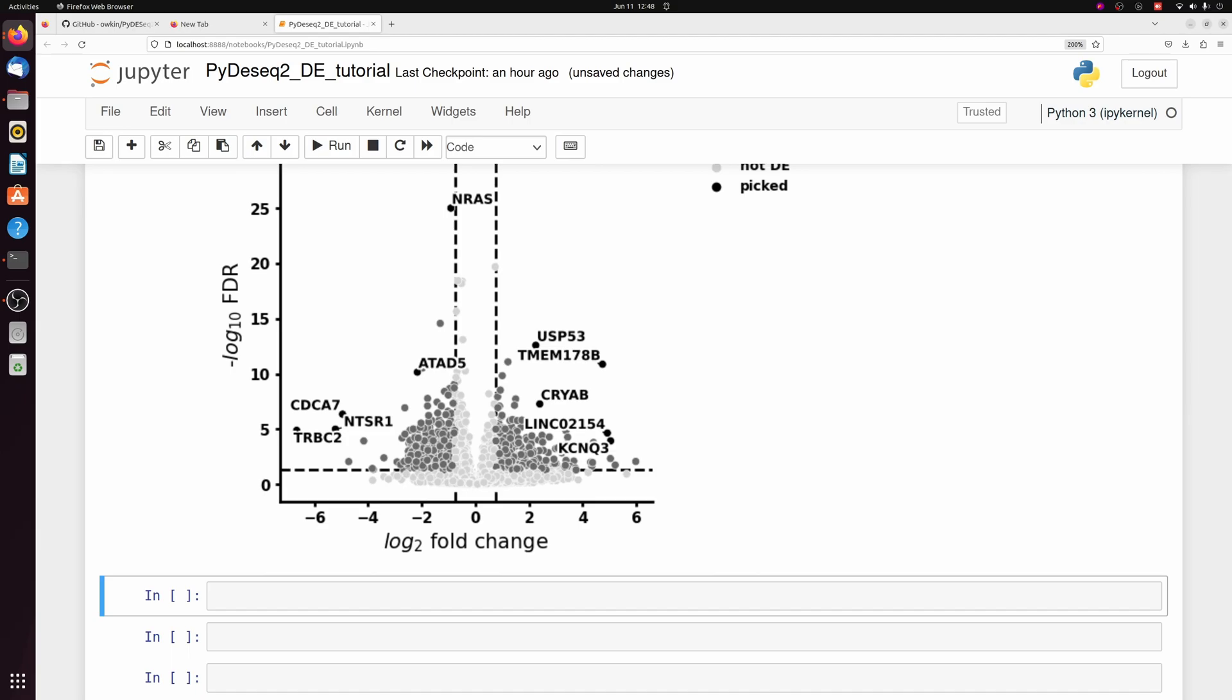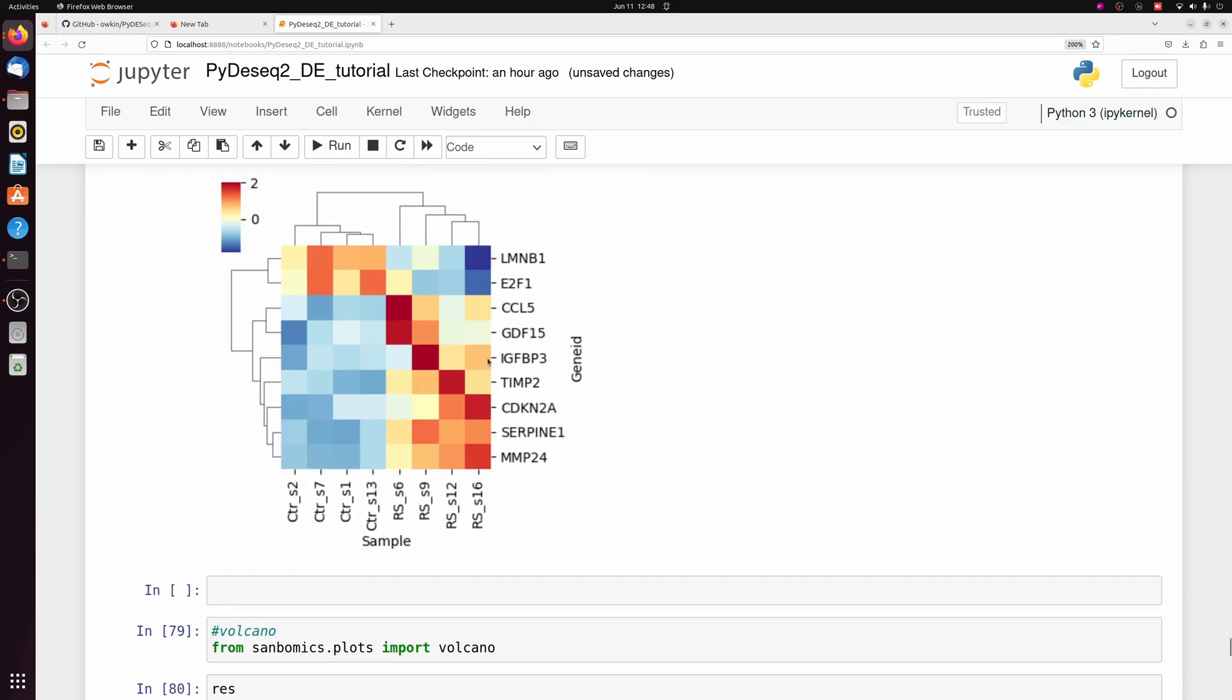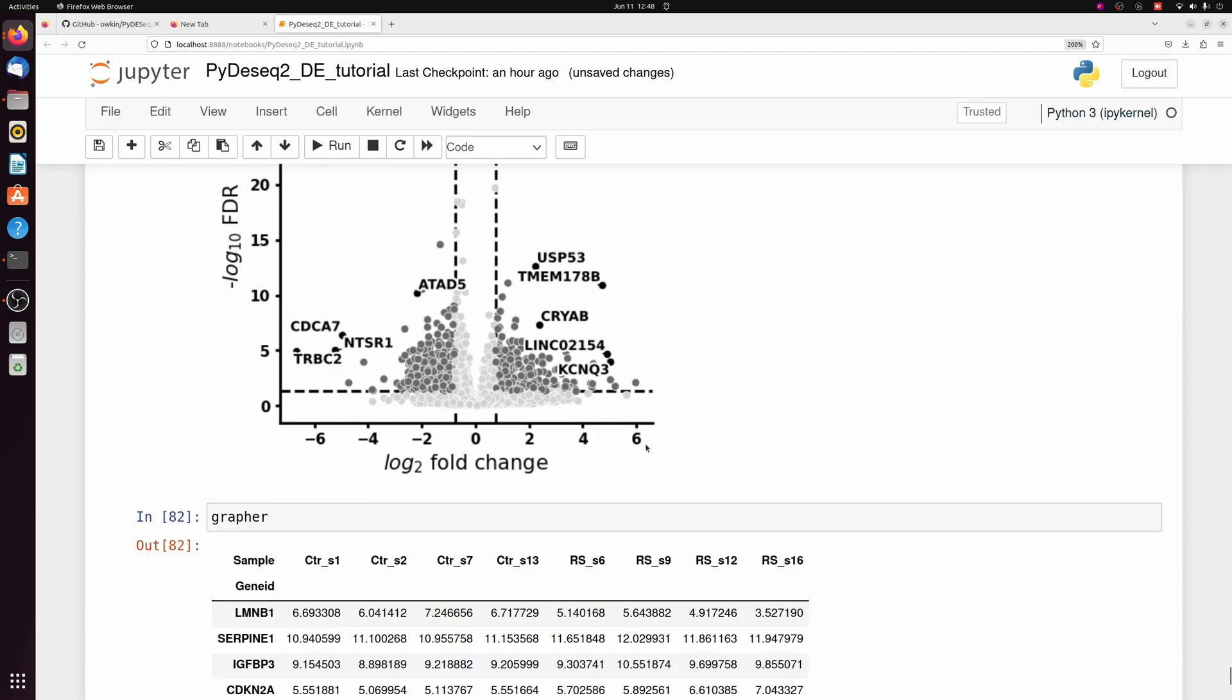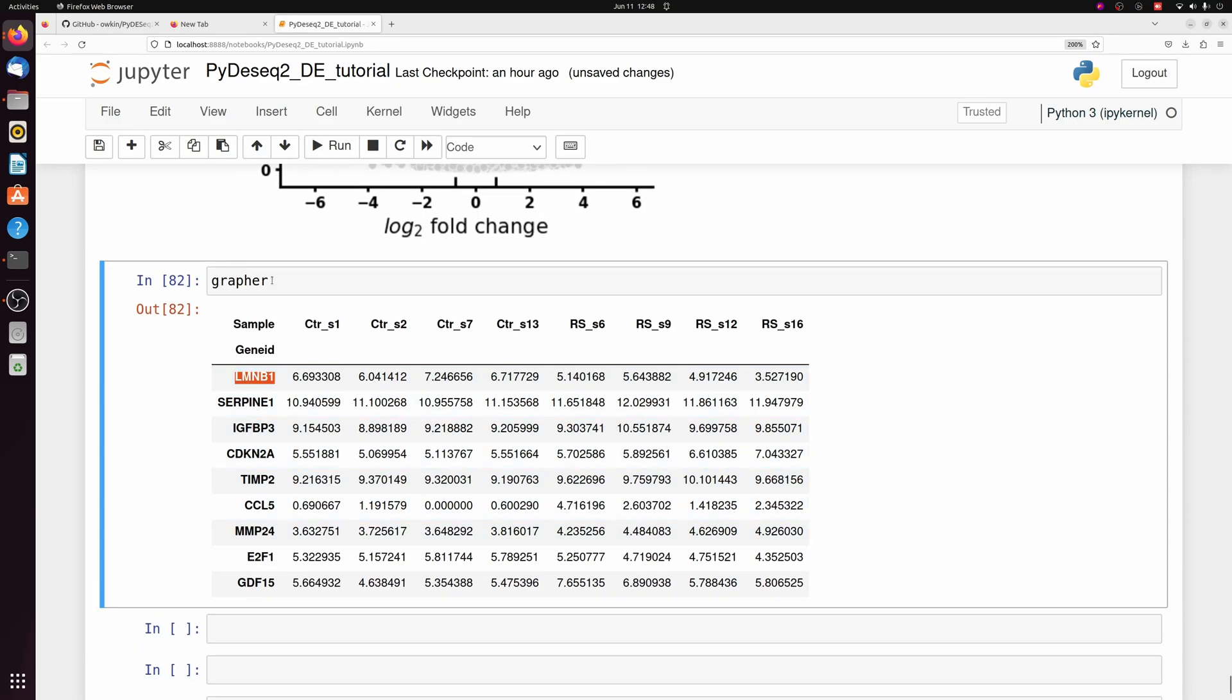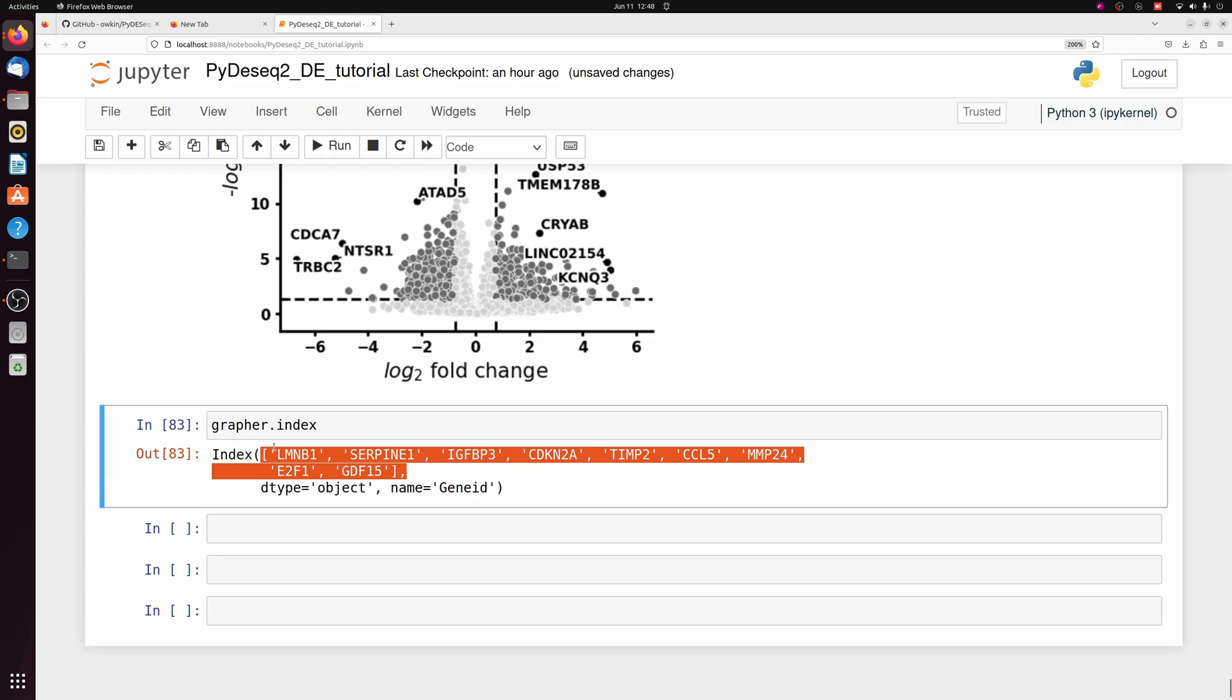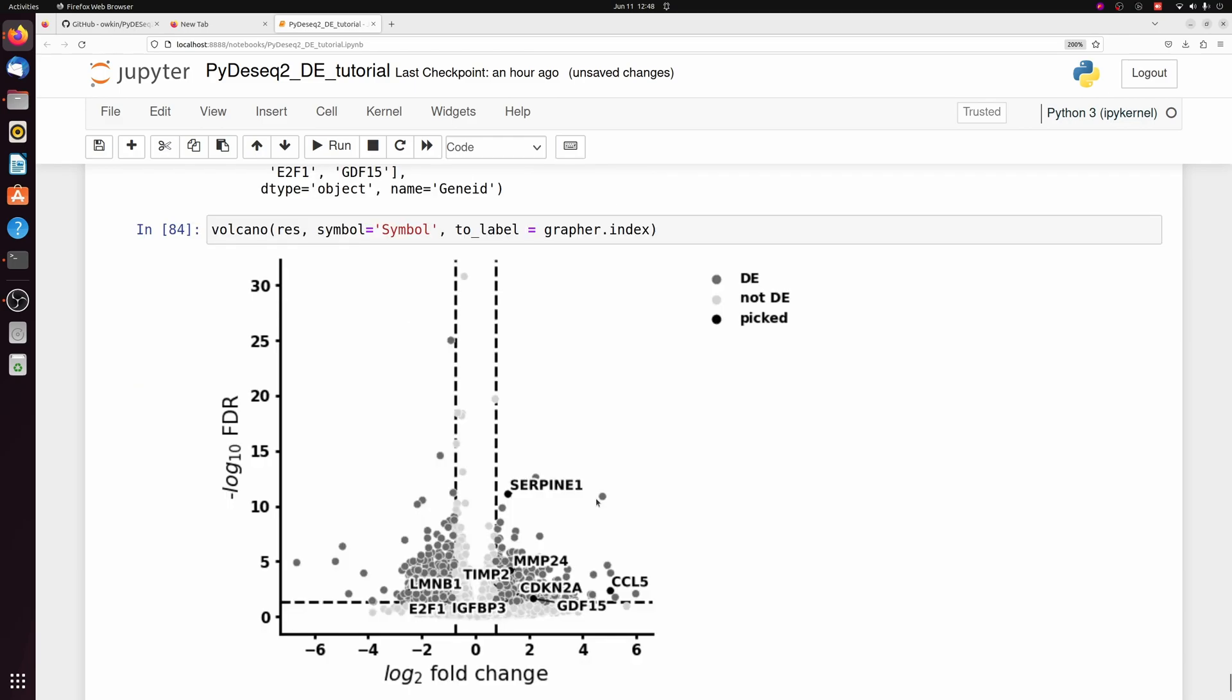For example, if I wanted to label these nine senescence genes, we had that grapher data frame, right? And then I'm just going to get the index column, which is the list of genes that were differentially expressed. So we can just pass that to the to_label to label those specific genes. And there's a lot of other things you can change with this volcano plot. I have a video that goes into this volcano tool more in depth.